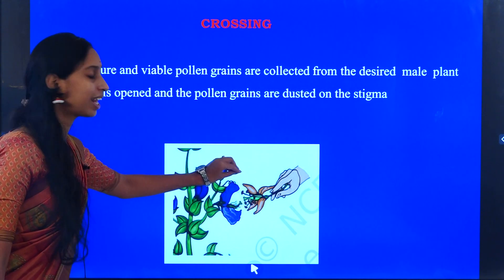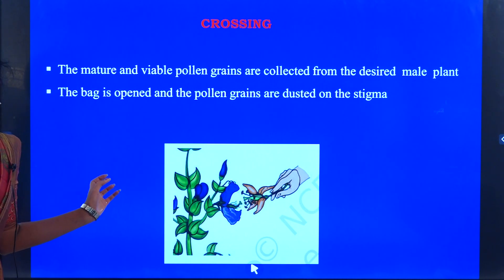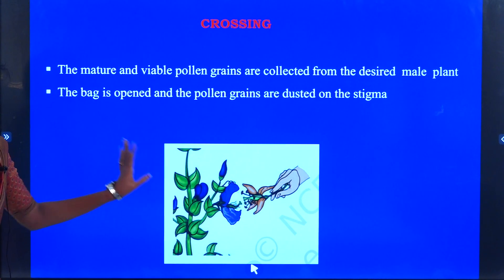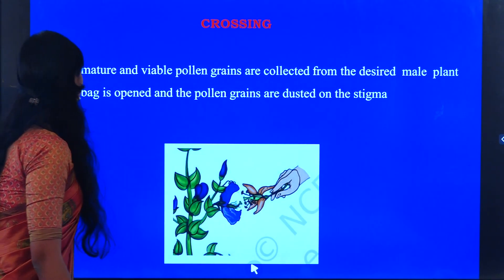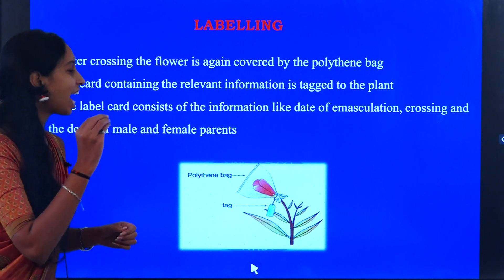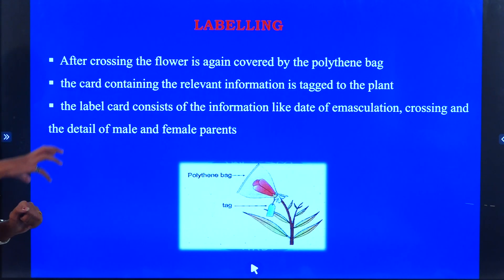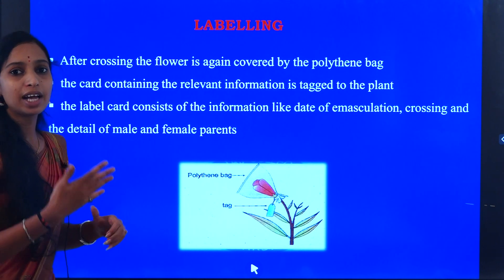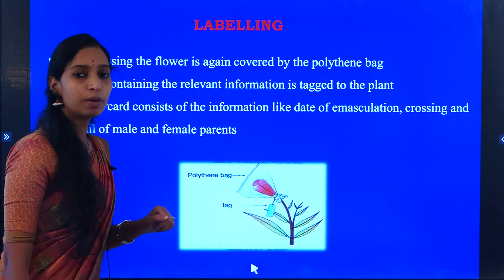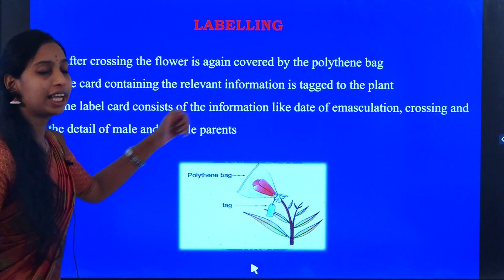After dusting, we cover it with the help of a polythene bag. The next process we are going to do is labeling. The label consists of information like the date of emasculation and the date of crossing.